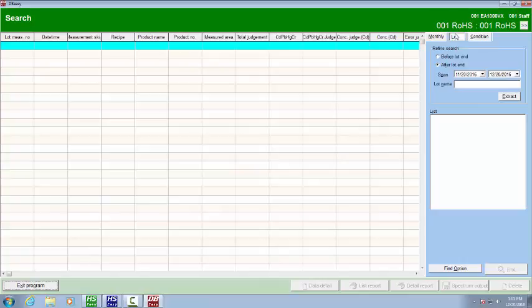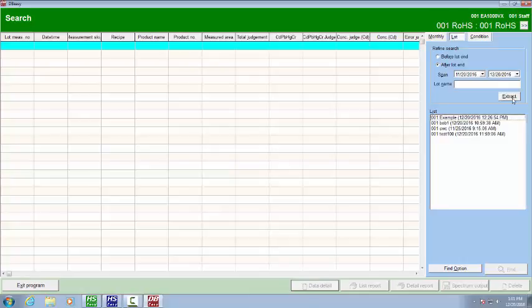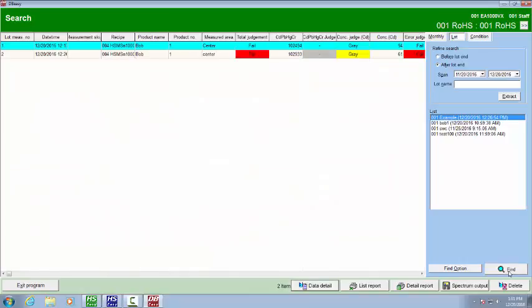You can now select different ways to search through the data group: monthly, lot, conditions. I have lot selected after lot end of these dates. I'm going to hit extract. You'll see several came up. We were using lot example today is what I named that lot at the end. So we'll select that and we'll hit find.